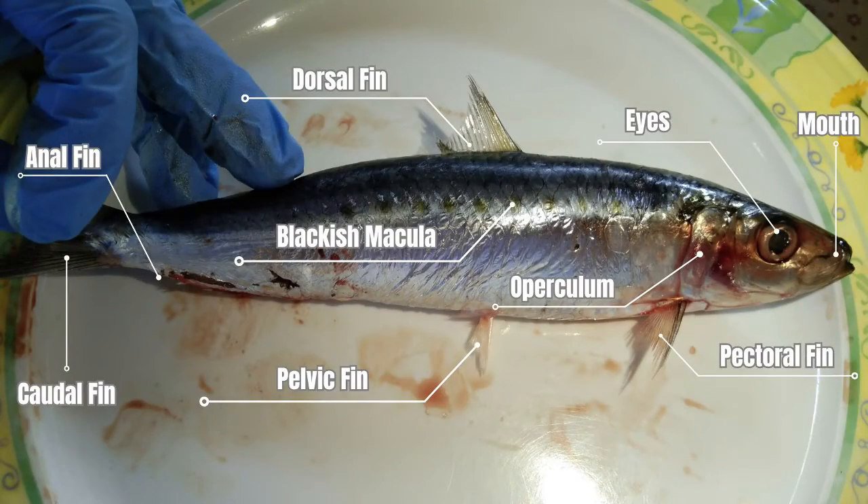The mouth is used to consume food. Opening the mouth, we can see its tongue. The eyes are used for eyesight — they use their vision to escape predators and find food. Fish eyes can detect colors and see short distances. The operculum is the bony flap that protects the gills; it opens and closes to allow water to pass over the gills. The blackish macula is the pigmentation at the dorsum of the fish.